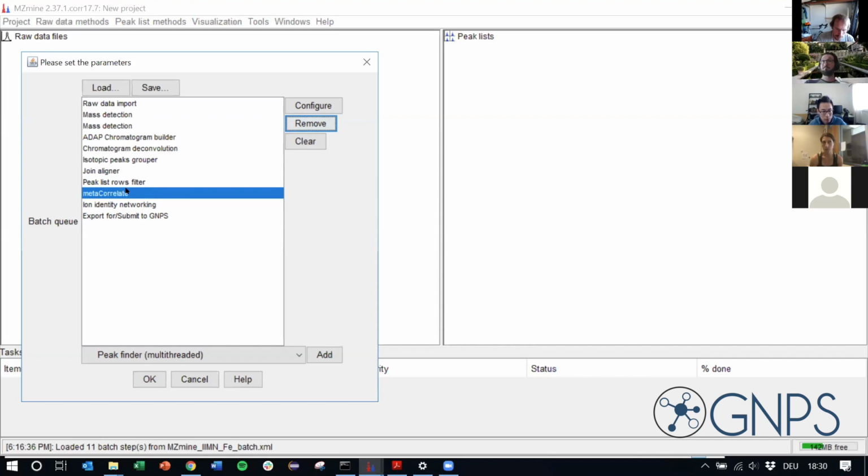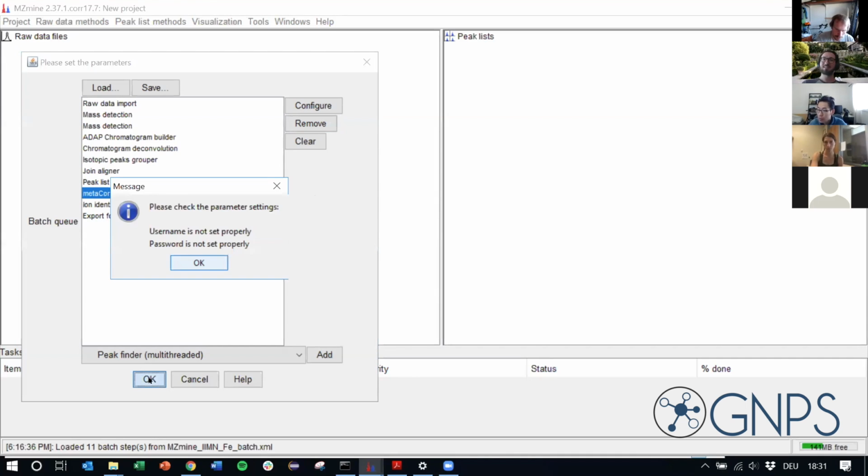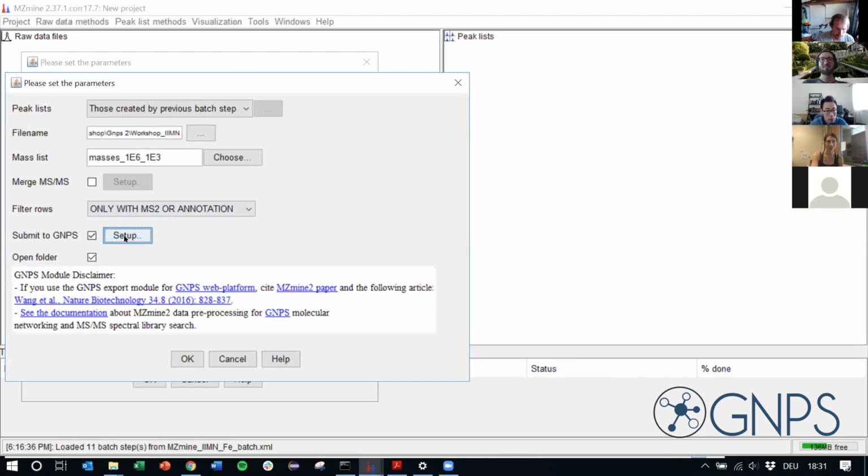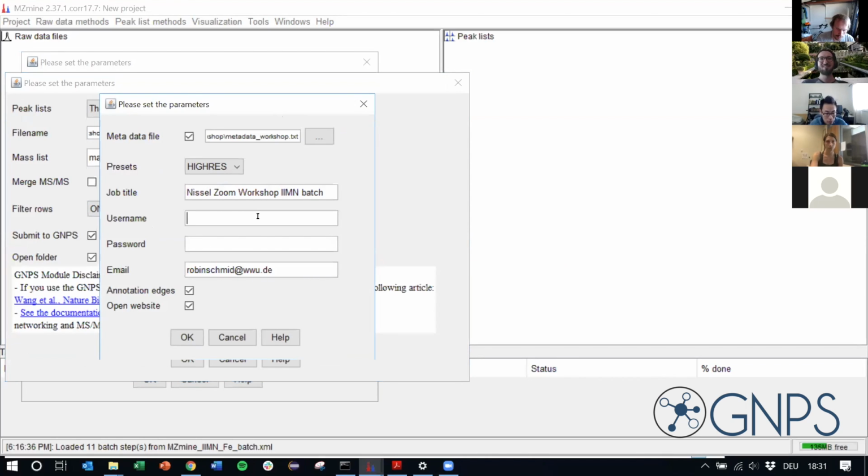Okay, I think we're fine to go. If you have any questions, you can also ask me afterwards. I'm just going to click on OK, and we're going to run it. And I hope that everyone is following. Oh, wait. In this version, we need the username. Since when? I programmed this, and it seems like we need the username and password. It's pretty funny.